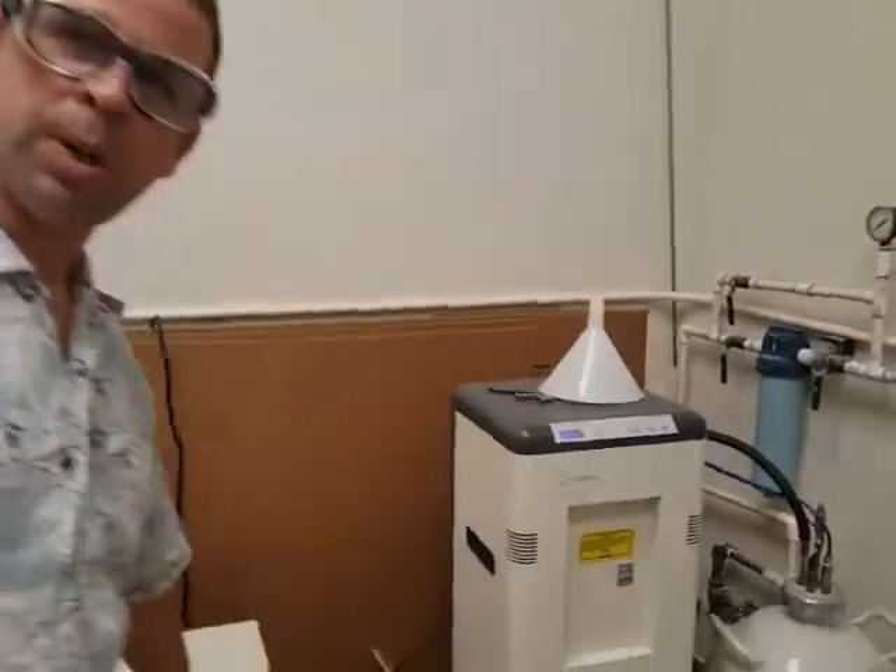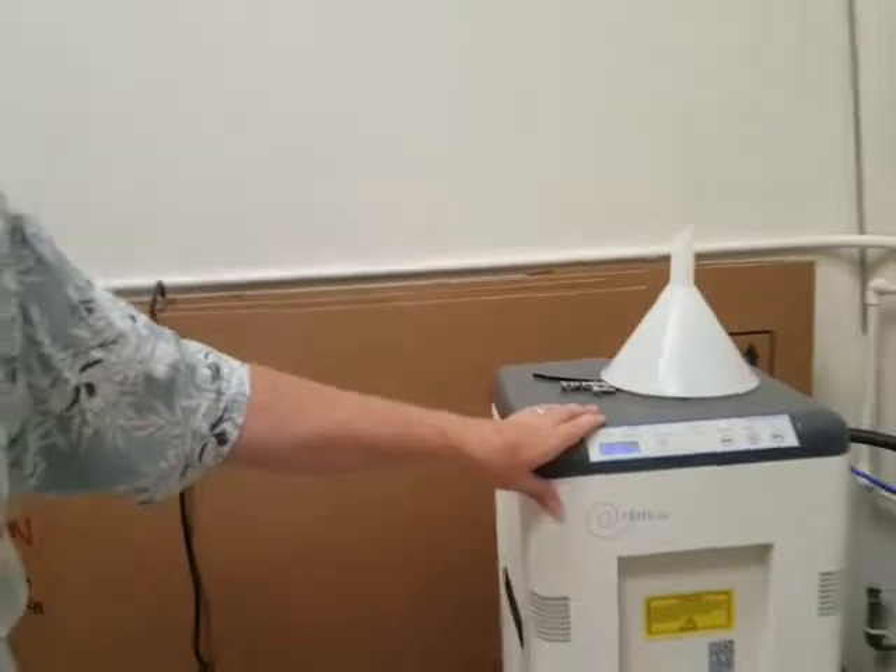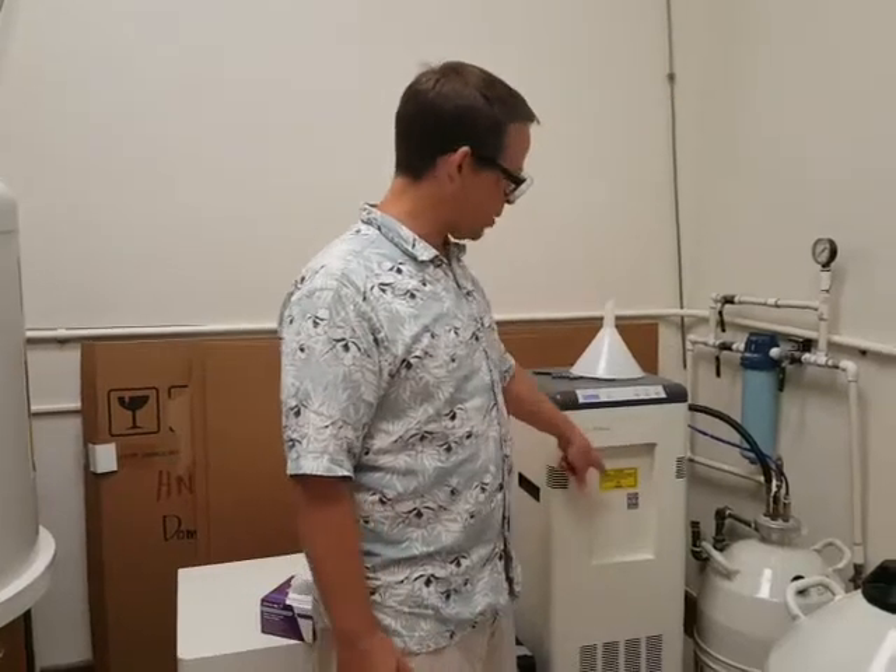I'm going to show everybody how to get liquid nitrogen out of our generator. This is the generator here, and this is the compressor. It compresses the air and then pumps it into the generator at high pressures. Then some refrigerant and pressure changes result in liquid nitrogen from the air.